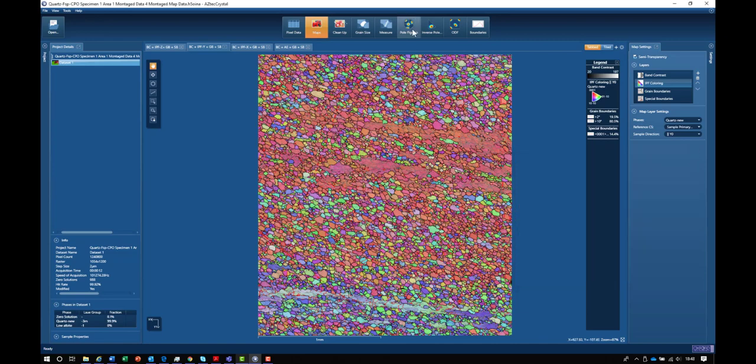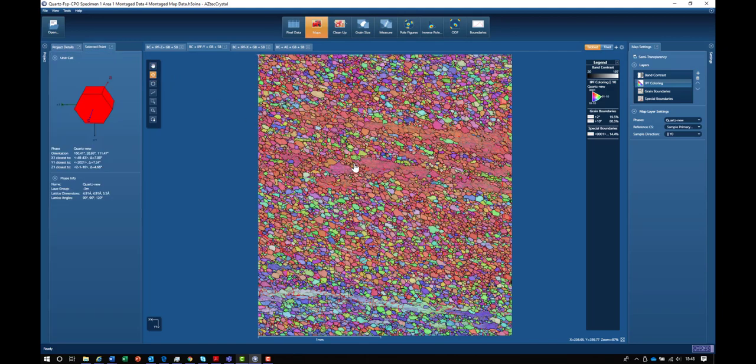Aztec Crystal also allows us to look at the individual orientations in a graphical form. We can do that by switching to the individual point selection mode. If I click on one of these red grains, we can see the orientation of the unit cell shown on the left-hand side as it is relative to the map.